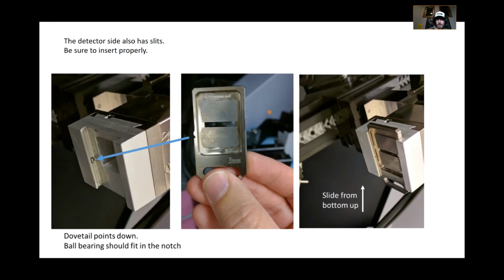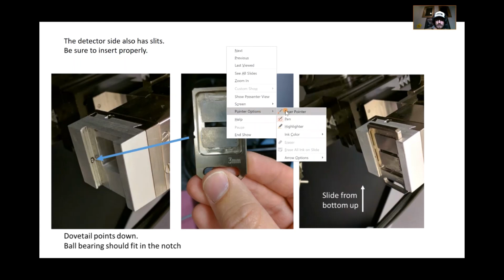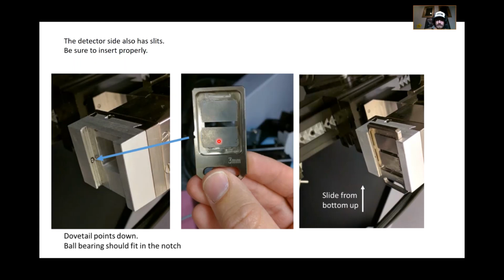And I'm almost thinking I'm showing bad PPE habits by not wearing gloves. But there are people that say you're not supposed to wear gloves when you handle instrumentation, so I kind of argue against that as well. But these, hopefully you see the pointer. Let me get to a laser pointer. These are lead, and I admit this. I'll admit this because I admit it all the time.